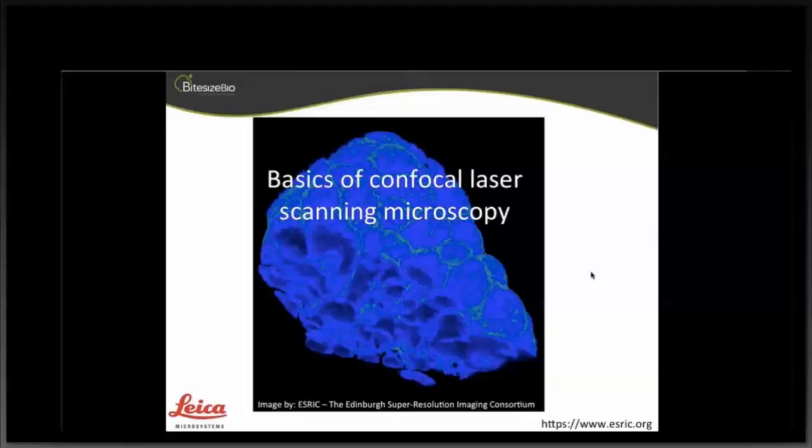Okay, thank you. Are there optimal laser powers for each laser, or is this very much sample dependent? I would say it is very sample dependent. The laser power is a percentage. We have our argon laser on 30% in the back and our white light on 70% in the back, and then on the front we change our percentage, but it is dependent on the lasers. When we had our upgrade, our actual percentages changed, and we had to get into the mindset of using a different percentage and thinking it was brighter, but actually it wasn't, because it is just an arbitrary percentage. It is quite sample dependent, so I wouldn't think, well, I used 20% on this microscope, so I should use 20% on the next microscope. Or day to day, if you have a bad sample, then you may need to change your laser power.